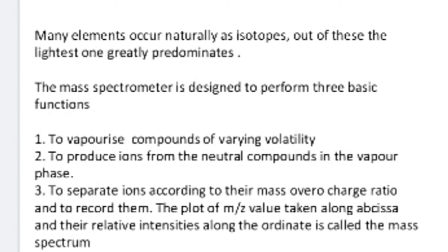The third one, and especially the most important point, is to separate ions according to their mass over charge ratio and to record them.